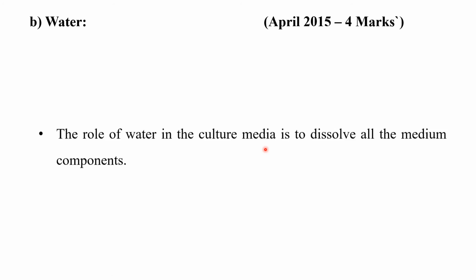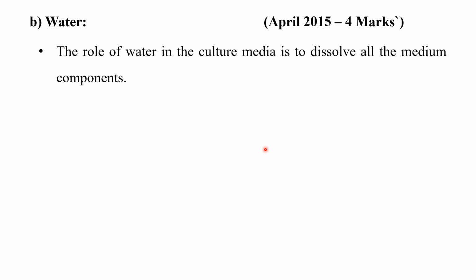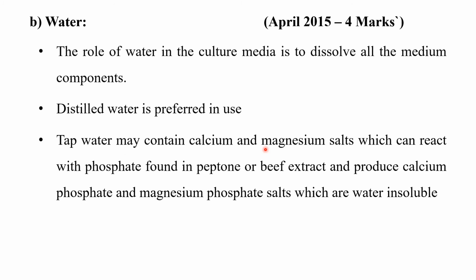Next one is the water. As you know, water is the most important dissolvent. In the case of culture media, to dissolve all the medium constituents or components, we require water. Mainly, distilled water is preferred while preparing the media.